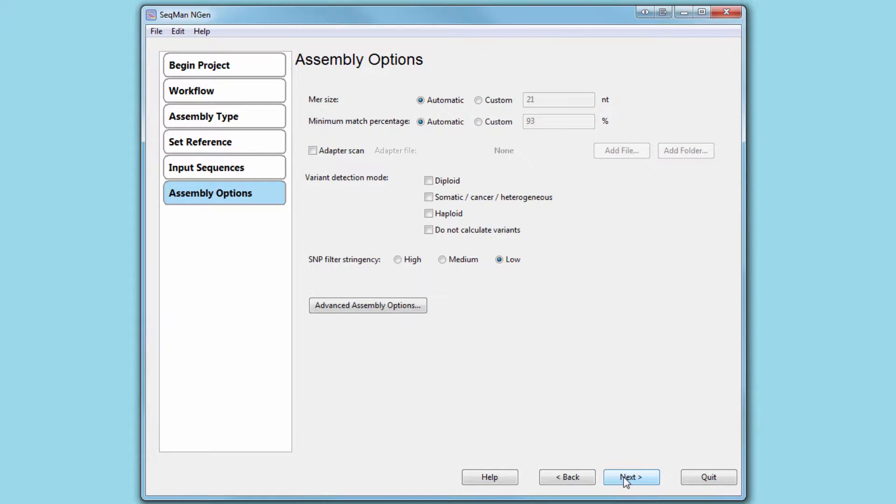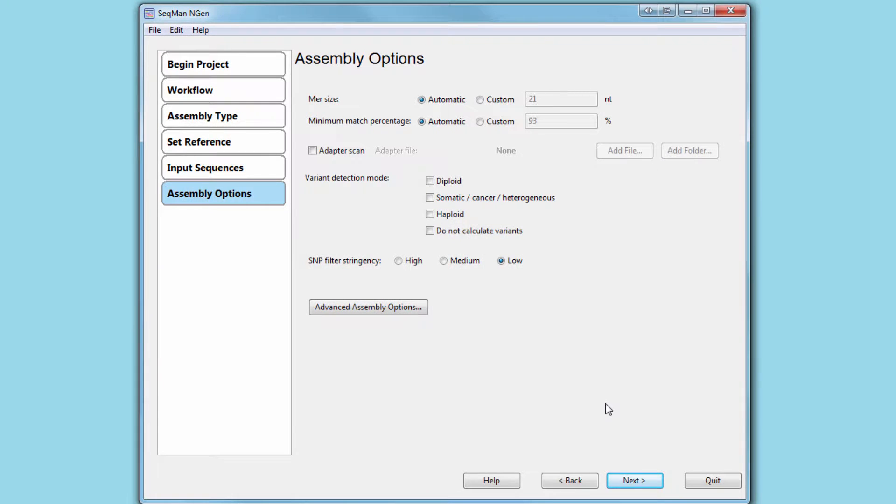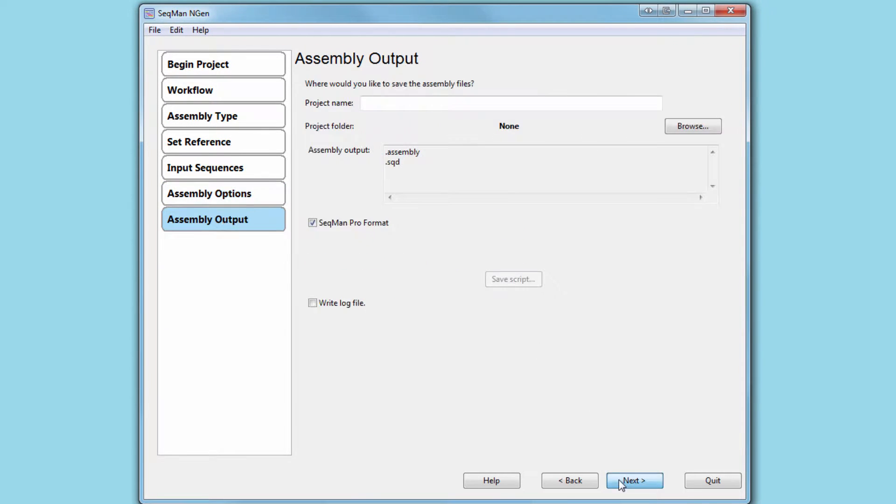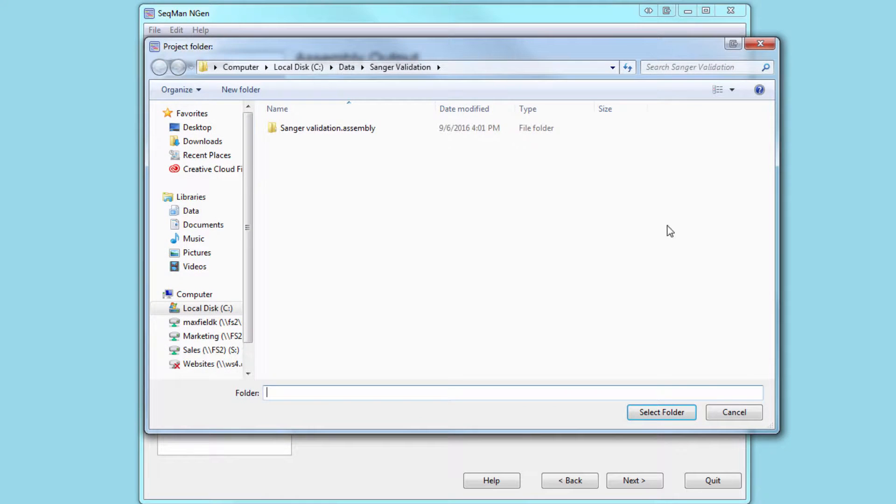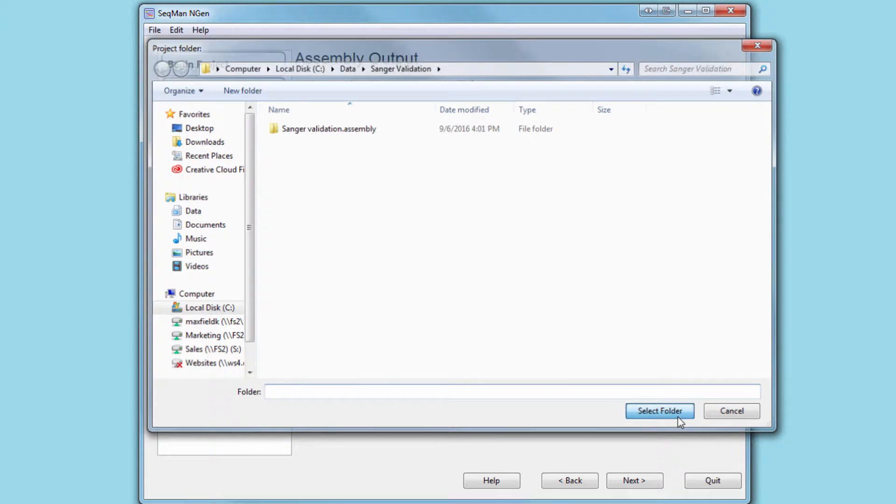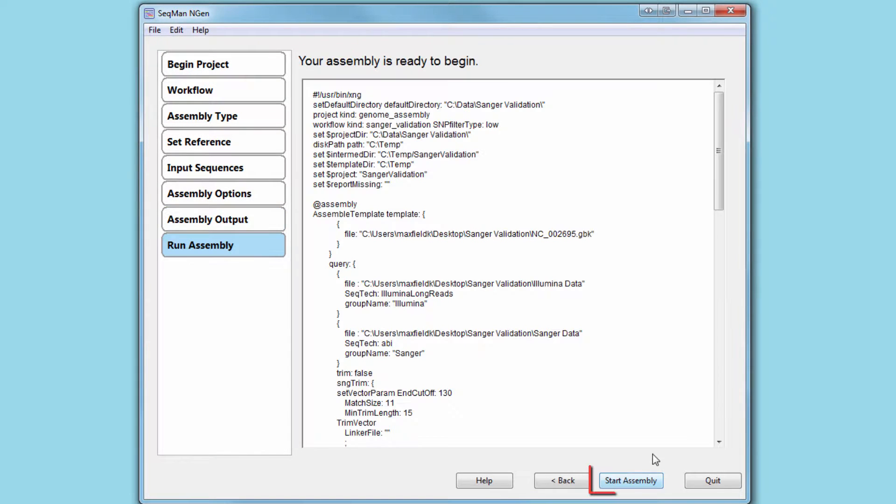On the assembly options page, select your preferred variant detection method, then name your project and specify a project save location. Now your assembly is ready to begin.